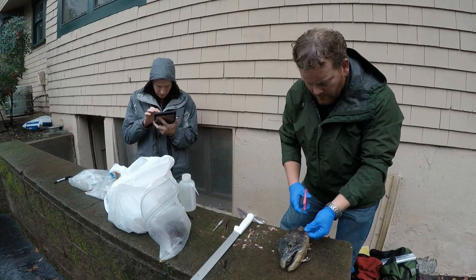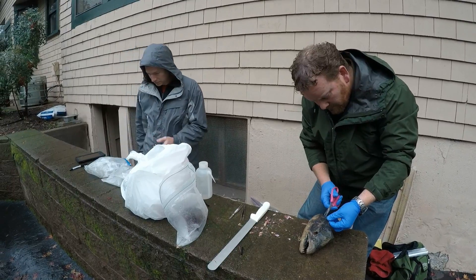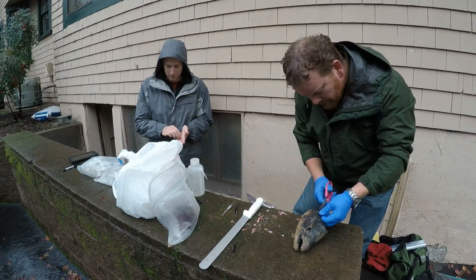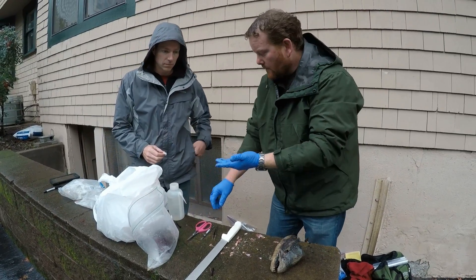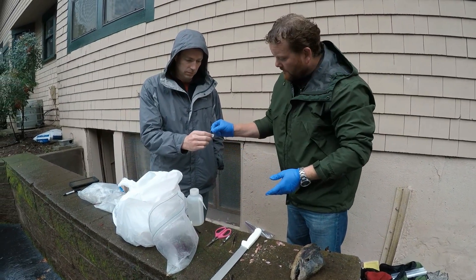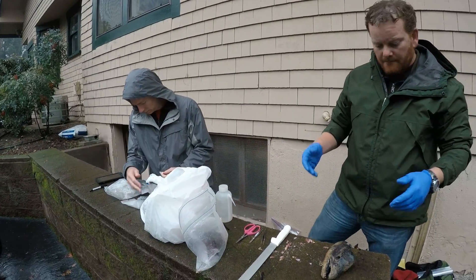We collect a little genetic sample — try to look for the tissue that's in the best shape. This looks pretty good. We collect a little one-centimeter square and put it in blotter paper to dry it out, keep it from rotting, basically.